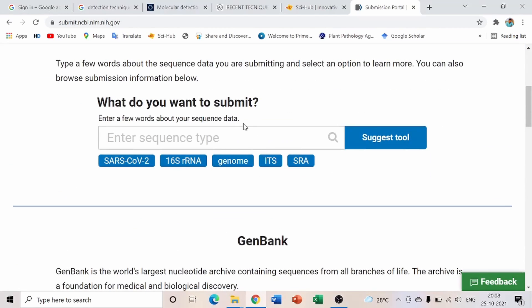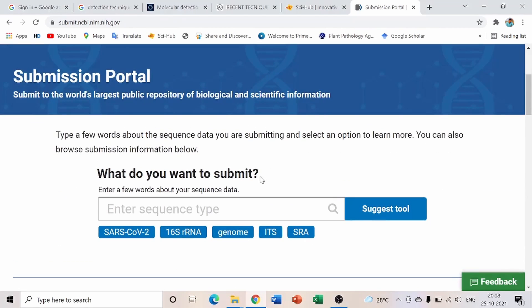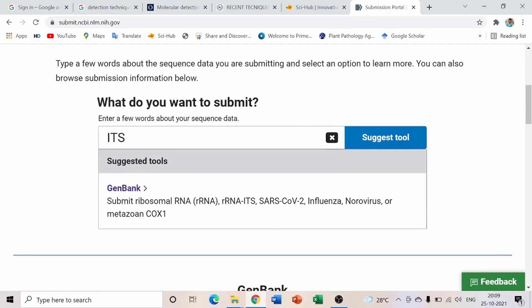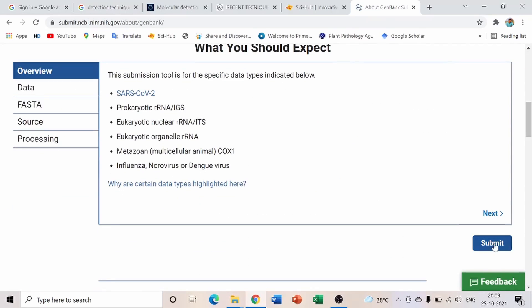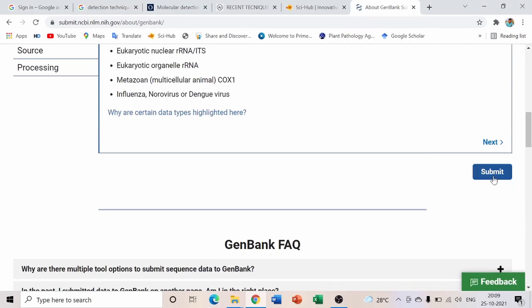Once logged in, a page will open where you can click 'Submit/Deposit Data or Manuscript into NCBI.' Since we use ITS primers for fungal cultures — specifically ITS1 to ITS4 primers — click on ITS. It will show 'GenBank Submitting Ribosomal RNA.' Click on GenBank.